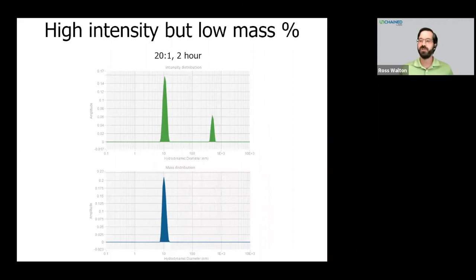So all this gives you an idea of the colloidal stability of your sample as you tweak the experimental design of your conjugation reaction. And sometimes adding too much of your reagent causes detrimental aggregation. And sometimes it causes maybe only slight aggregation or no aggregation. And if there's only a little bit of aggregation, perhaps it could be filtered out or dealt with in some other way.